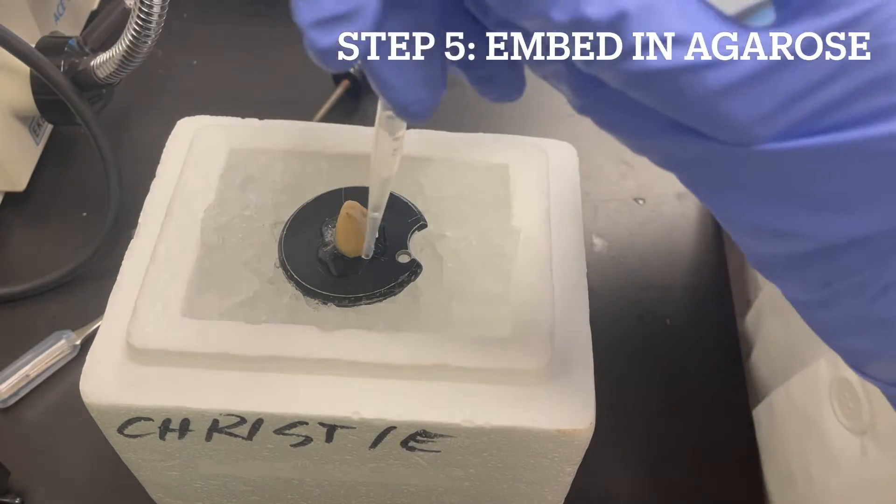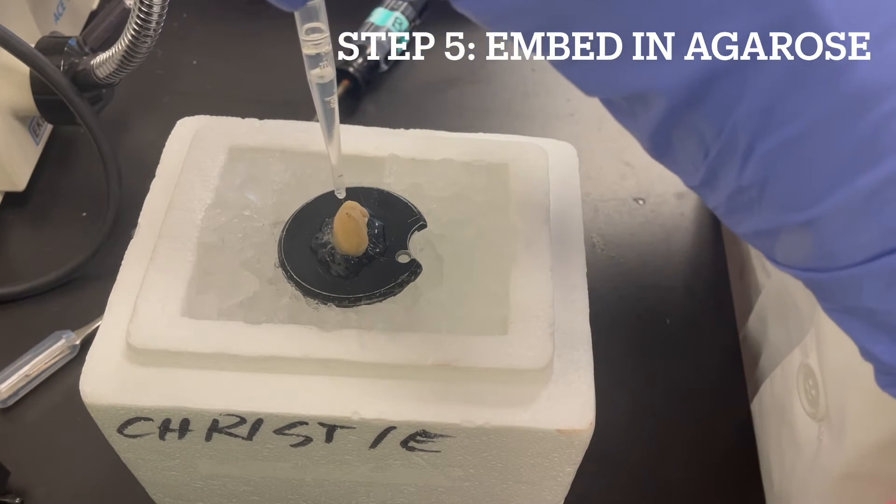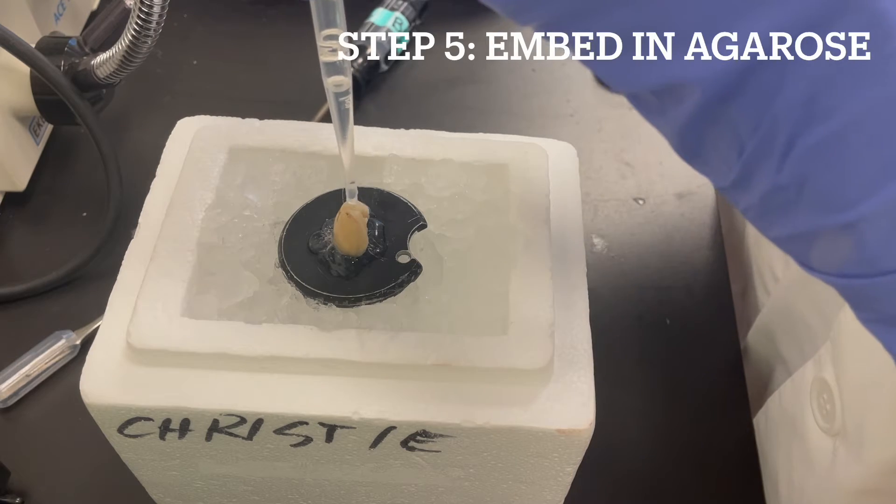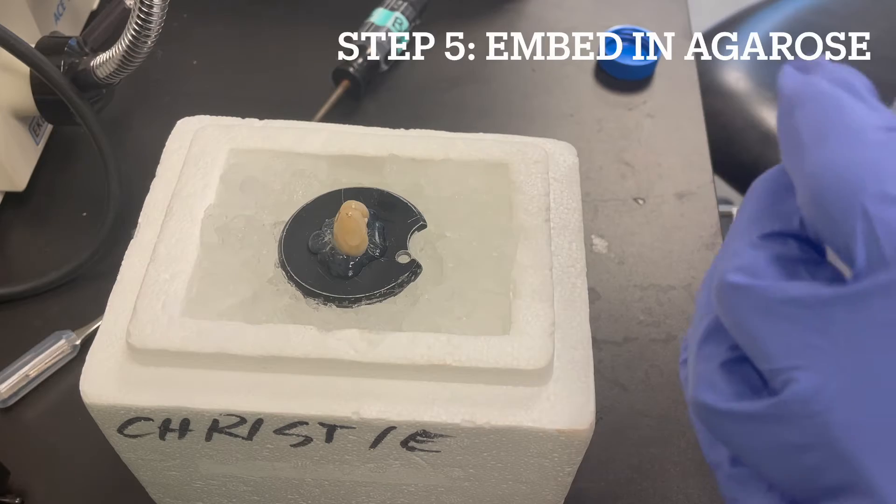Using the transfer pipette method, we first surround the brain in agarose, allow that to solidify, and then drip the agarose on top of the brain, letting gravity bring the agarose down to cover the entire tissue.